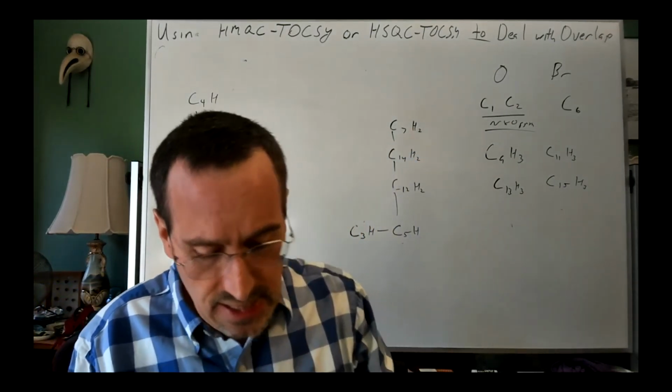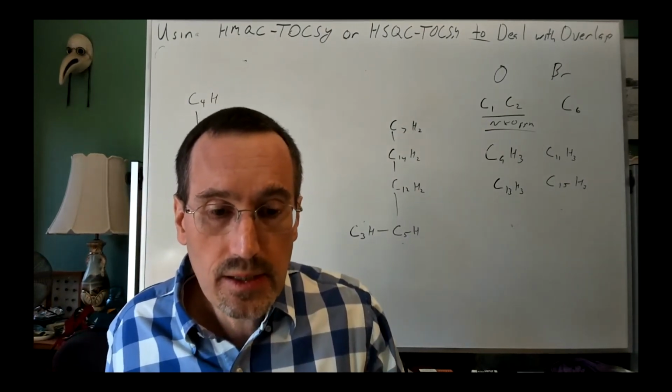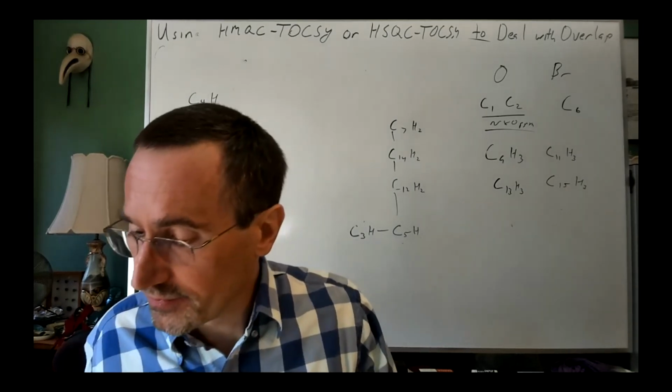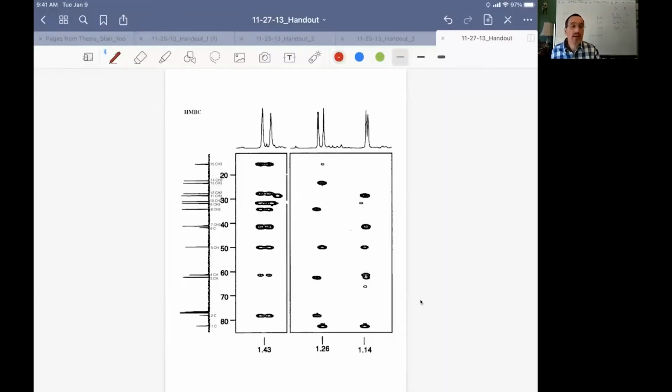So I'm going to give us an expansion of the HMBC at this point. And that should be the final page of your handout. So here's our expansion of the HMBC. They've given us some tracks here. They've given us C3H, which we can use, but I'm going to start off of the isolated methyls, and I'm going to start with the low-hanging fruit.